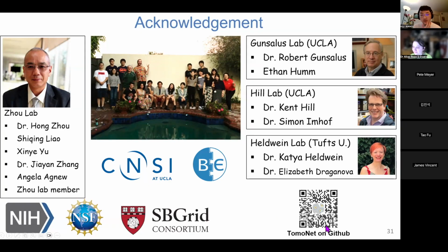TomoNet is already an open software on GitHub. If you're interested, you can go look into the details in there.